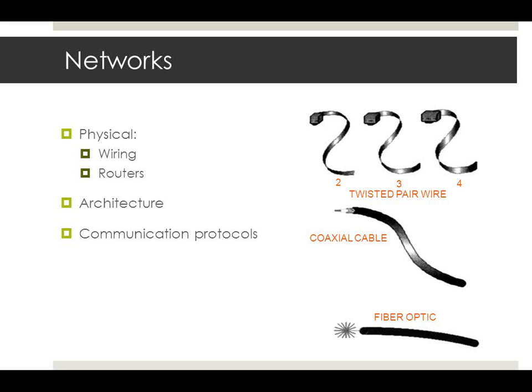With fiber optic cables, essentially you have to have 2 lines, because they only go one way. So for dual communication, you have to have 2 fiber optic strands. Actually, with some of the newer systems, it runs one way and then runs back the other way. But a lot of the current systems require 2 fiber optic strands to be able to communicate.